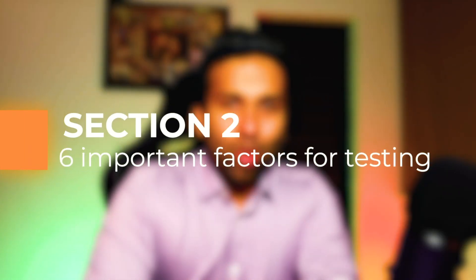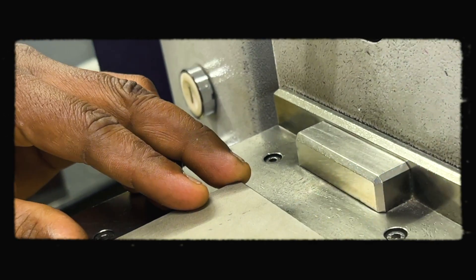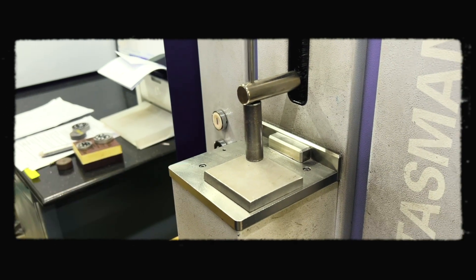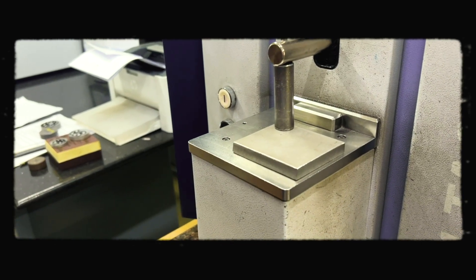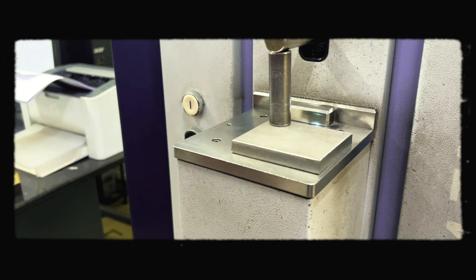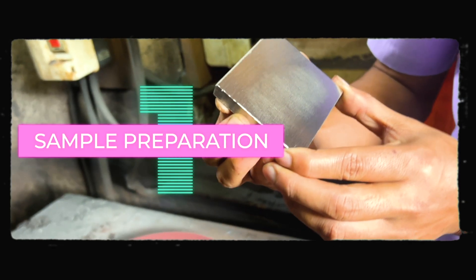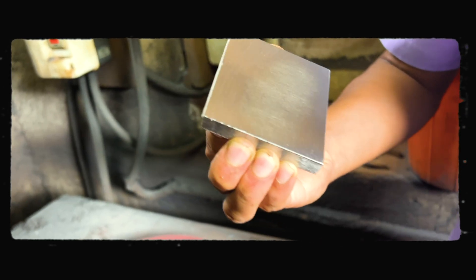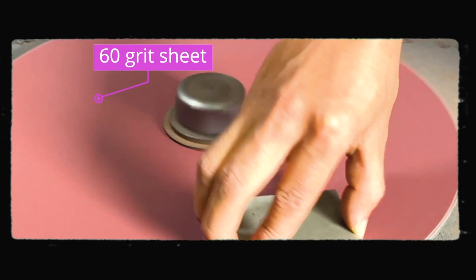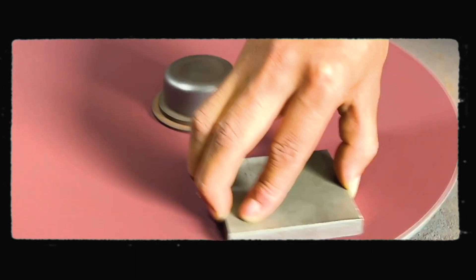Here we are in section 2. We will go over six important factors to keep in mind while testing the specimen. I'm going to demonstrate the testing — placing the sample on the stand and letting the spectrometer do all the work. A sound is generated which indicates the high voltage spark. Now let's move on to the important considerations. Point number one: the metal specimen should be nearly flat and the surface should be smooth. This is achieved by grinding the specimen with a disc — here we are using a 60 grit disc.